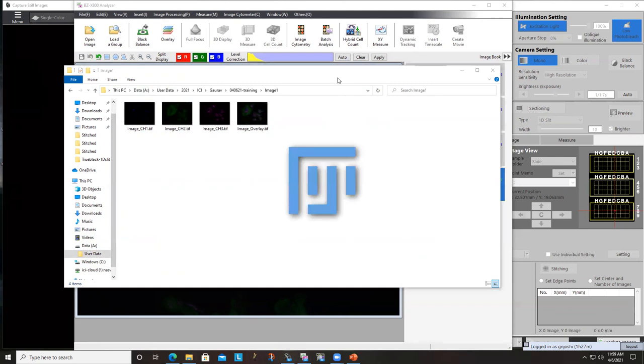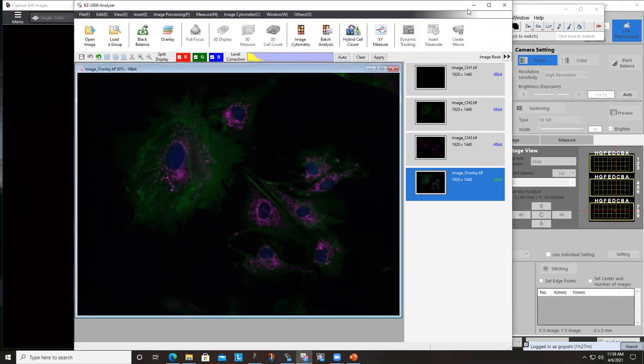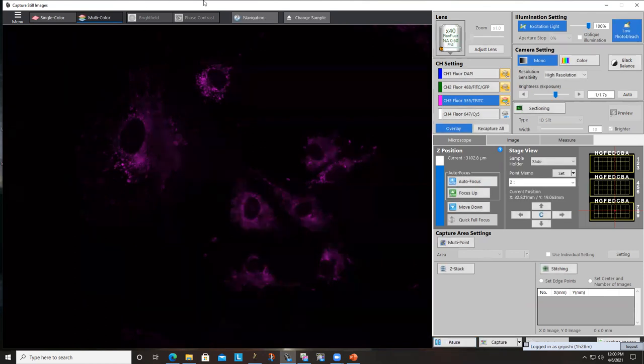So actually let's compare what happens if you acquire with grayscale and without, and with color. So right now we acquired everything with color. So let's acquire this in grayscale now. All right, so I'm going to turn off. So now at this point, you feel like you are stuck, nothing is happening, it's all grayed out. Click on this live image and everything will again be functional.